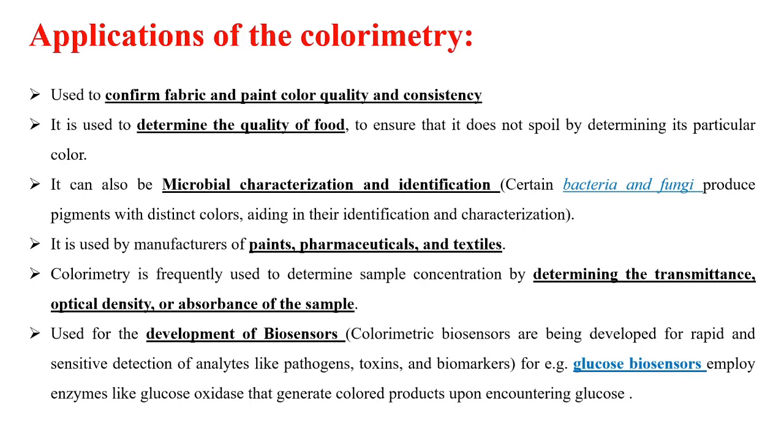Means, as sir has mentioned, the detector and the illuminator are on the same side. We have the detector here, we have the light source here. The light source will illuminate the sample and the light will be reflected back to the detector and it will be detected through a computer vision technique. We will get the color information of the sample. That's all.